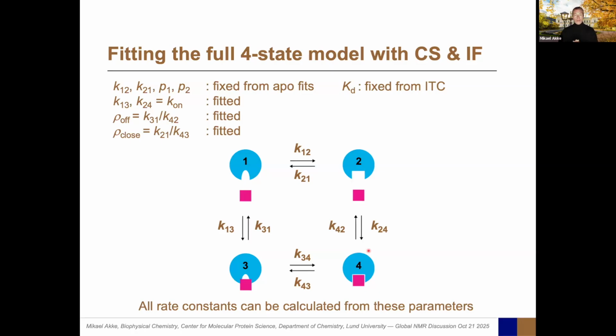Partly because, as you've seen, the conformational change going from apo to lactose bound is quite subtle. And I actually have a slide later where we determine the ground state of apo by NMR, and you'll see how very subtle the change is. So that's one consequence, that there's not a huge conformational change when you go from here to here.